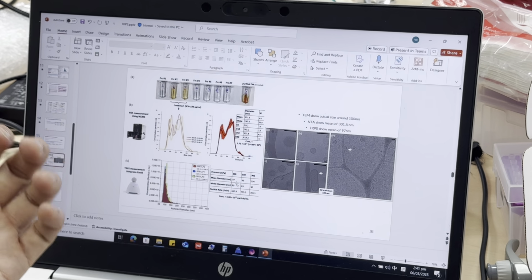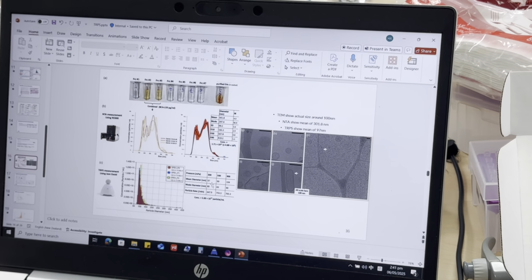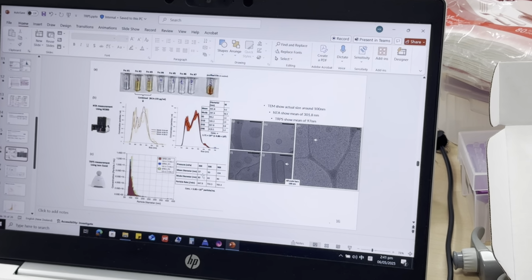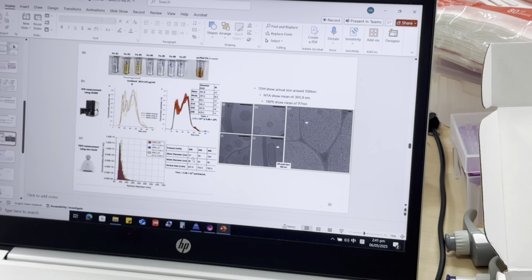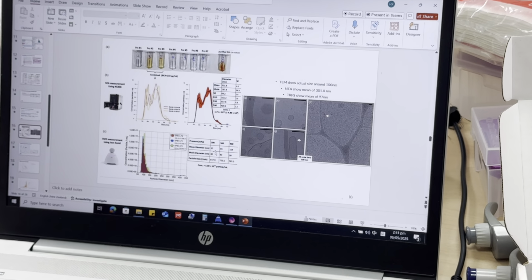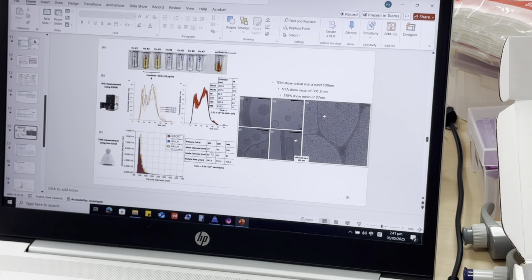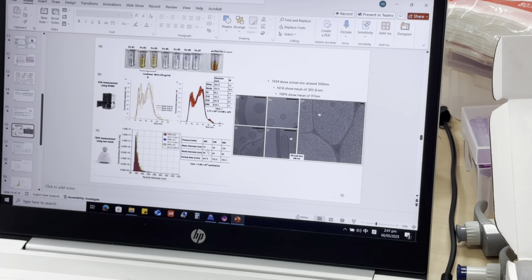And if the FDA asks, we have done sterile filtration and tested endotoxin, and all meet the requirements. Even though our upstream wasn't qualified as sterile, we use clean techniques to keep all the procedures as clean as possible, and we do the sterilization at the final stage. This way, they save a lot of money. They don't need to keep everything sterile. Okay.